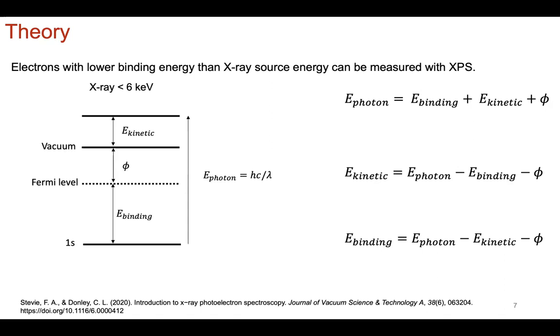Sometimes if you let the computer guess, it will say, oh, you have osmium or technetium, something ridiculous that you know is not sensible. But it's all tabulated in the software, because this information is already known.